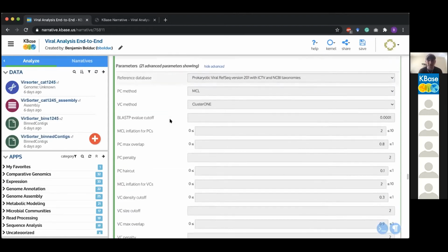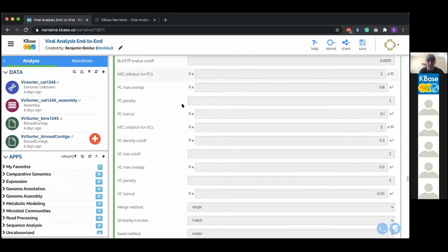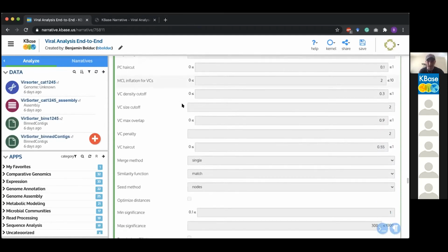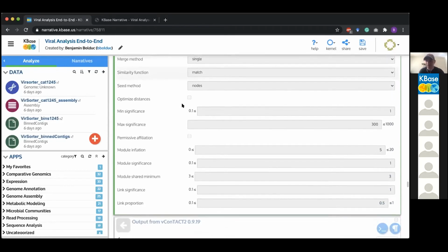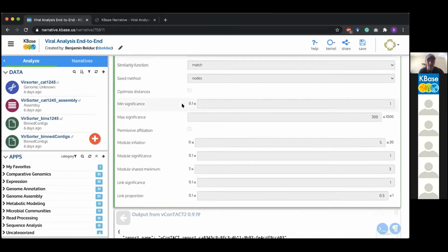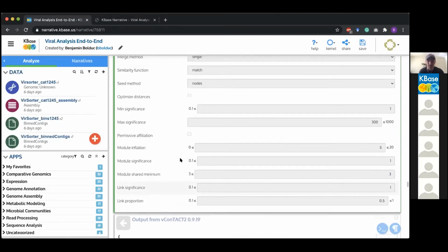And I'm going to run out of time, but these are a lot of options here. I apologize that I can't go through all of these. There were quite a few here. I was on a run adding a bunch of these. Most of them you won't have to change.